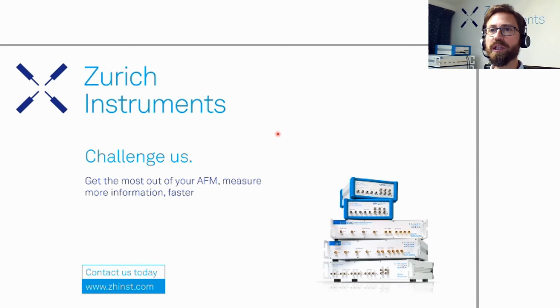Okay, now I have a more technical question, from Lucas. How do you compare the CPD value in the different modes? We have shown two, but there could be more, depending on the cantilever amplitude. This is definitely a complicated question. It's true that it would have been nice to see the values match a little bit better.